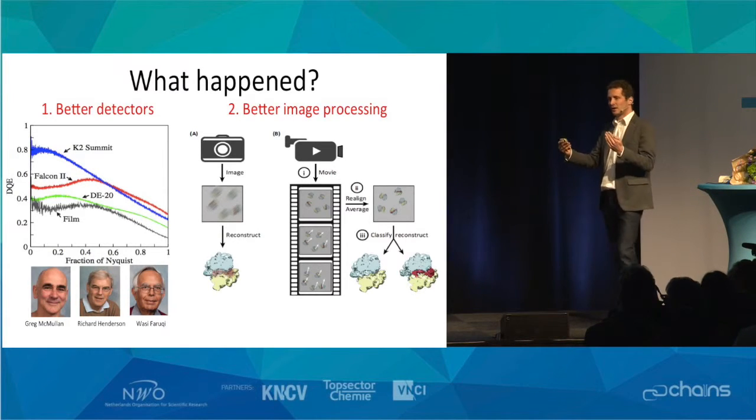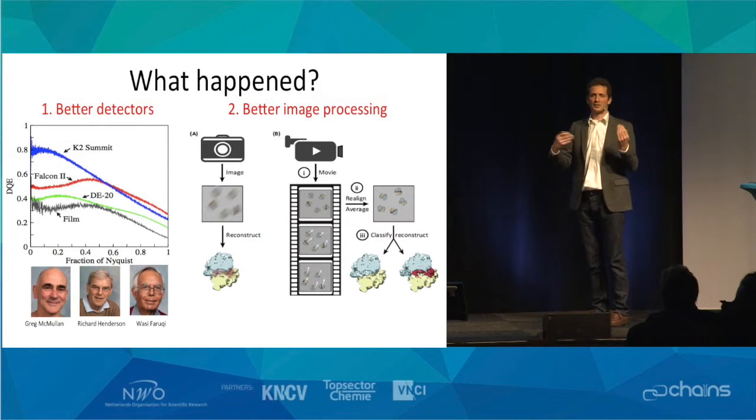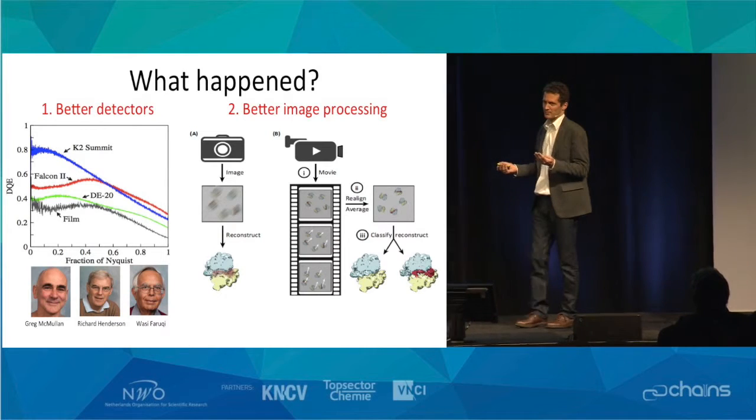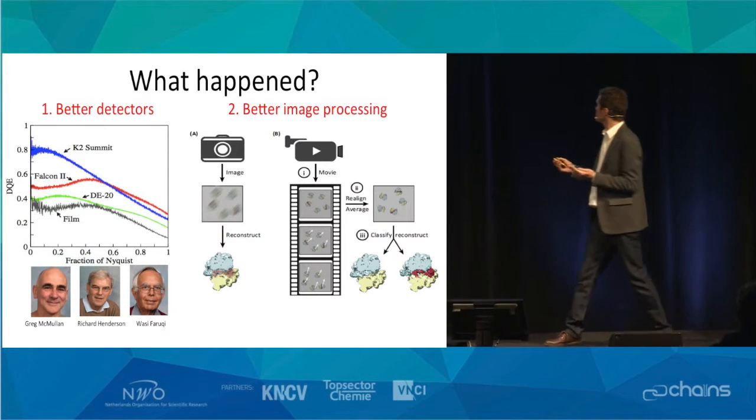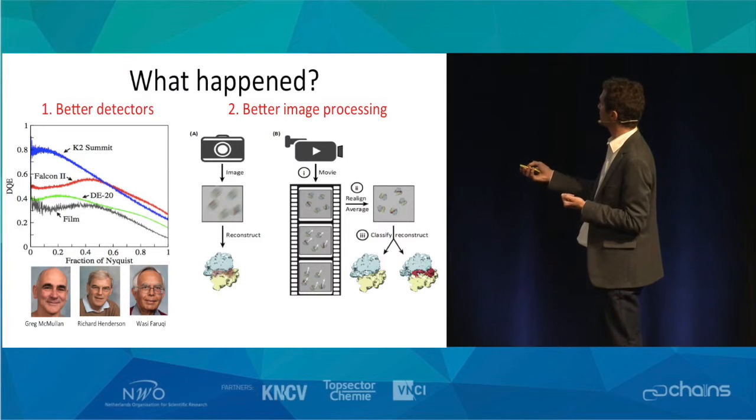Now, the second major advance in the field is closer to my own work, and that's the development of better image processing algorithms. And there's 2 aspects of this which I'll discuss in a minute.